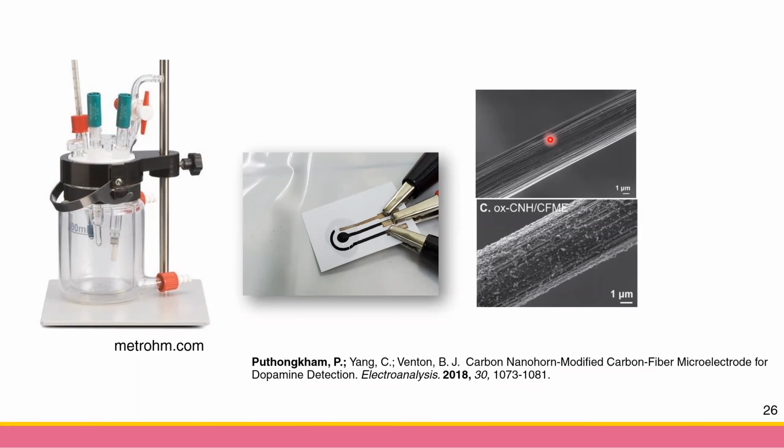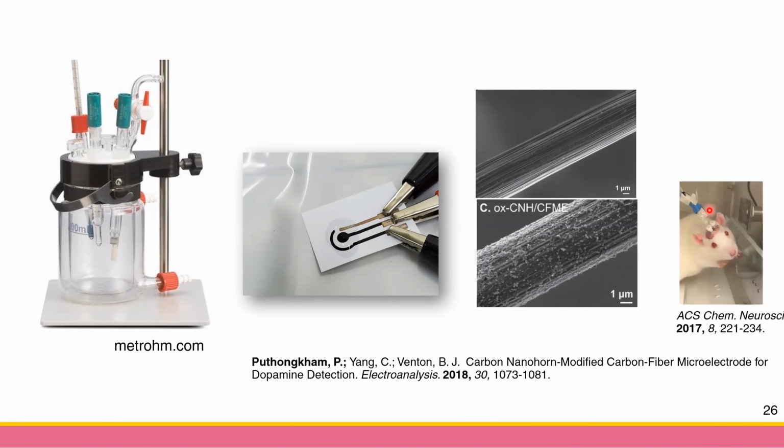And people usually use these small electrodes to put it in some animal to study the biological activities of something. Like this is electrochemistry of neurotransmitter. So they're measuring the neurotransmitter in the rat brain.